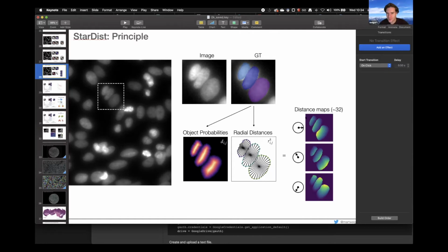So this is, for instance, one of the distance maps that will get constructed during ground truth. So from this ground truth object, you calculate this, and this is for every pixel. So every value here indicates the distance of that pixel in the right direction to the next boundary, right? And you see everything on this side is very high, because it's farthest away for each ground truth object. And everything that is close to this boundary along this predefined direction to the right is a low value, right? And this is a dense image, and for every direction you have one of those images.